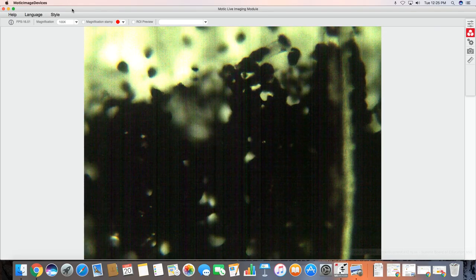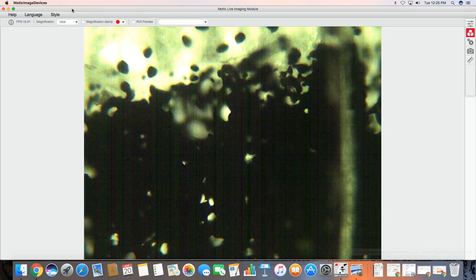If I want to go even further, see even more detail, I'm going to switch to my high power, my blue objective lens. Now see how blurry it is. I can't use the coarse knob here, I can only use the fine knob to sharpen the image. And look at all those little ink splotches. Kind of looks like splatter paint. Because the paper itself isn't as smooth as you think it is.